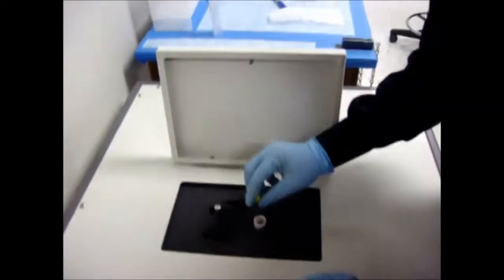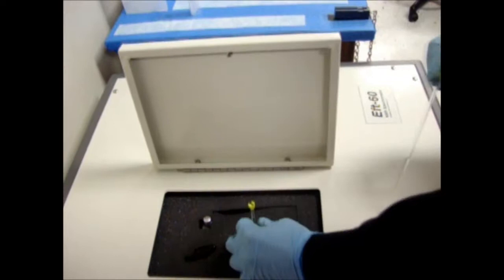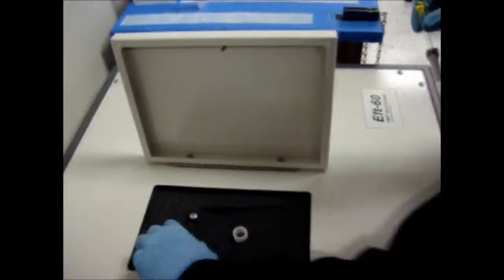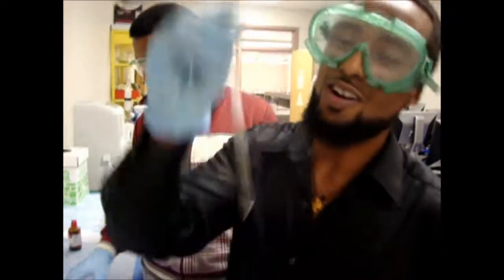Now we're going to put it into the machine. There's nothing in the machine, correct? That's right. That's what I'm here for. So, when you first check that there isn't anything in the machine, you actually find what you're looking for, which is this little particle right here. This is what's going to be used to hold our vessel. All right.